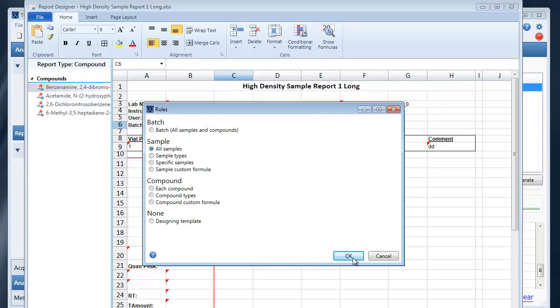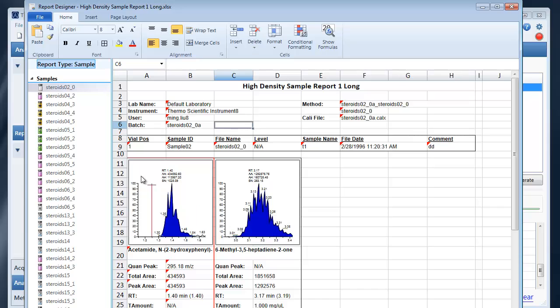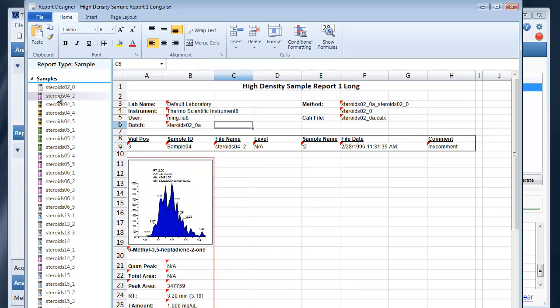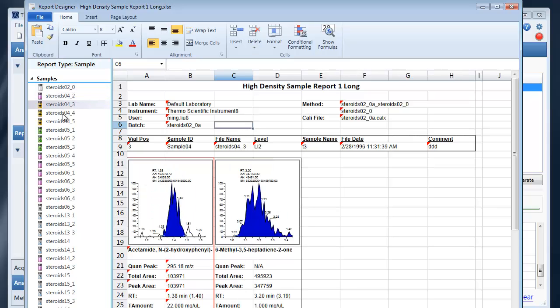And if I switch back to samples you'll see all the results, compound results, for a given sample.